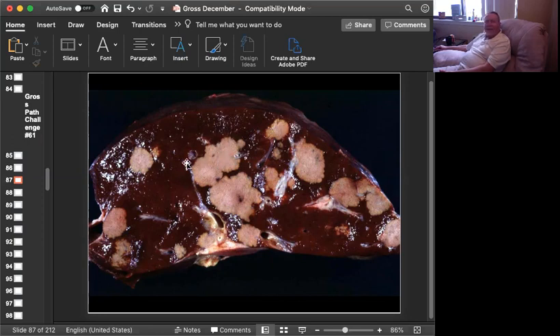If there are any inflammatory cells around the outside, they would like to get in and clean them up. But just a great picture of bland necrosis, my morphologic diagnosis. And look, if you look at the surface, it doesn't really bulge like abscesses. It's just necrosis. Here it involves the wall of a large vessel. And it wouldn't surprise me if we took multiple sections, you would actually see some thrombi within some of these large hepatic veins.